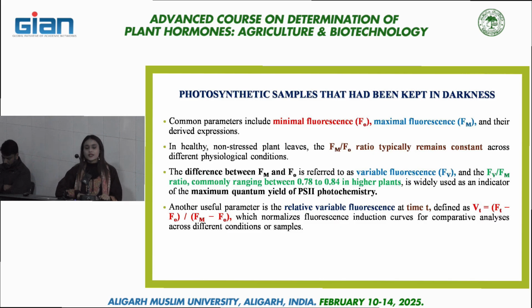Then we are going to study the ratio of Fm and F0. The ratio of Fm to F0 remains constant under different physiological conditions, but only under non-stress conditions or when our plant is healthy. But when we give any hormone treatment or subject our plant to any stress, then the Fm upon F0 ratio does change.